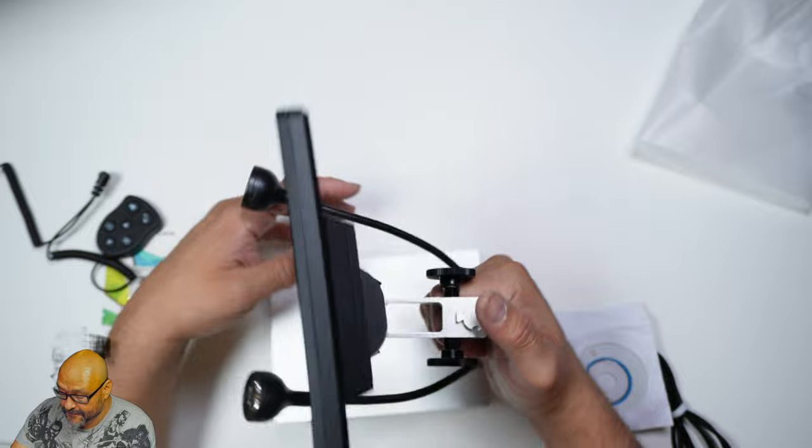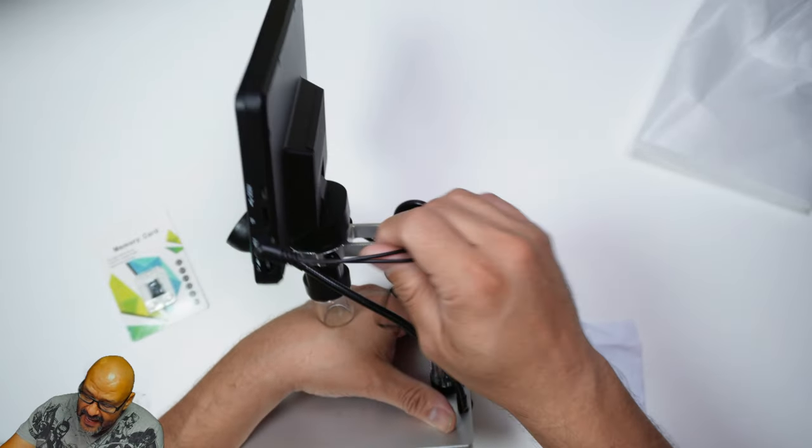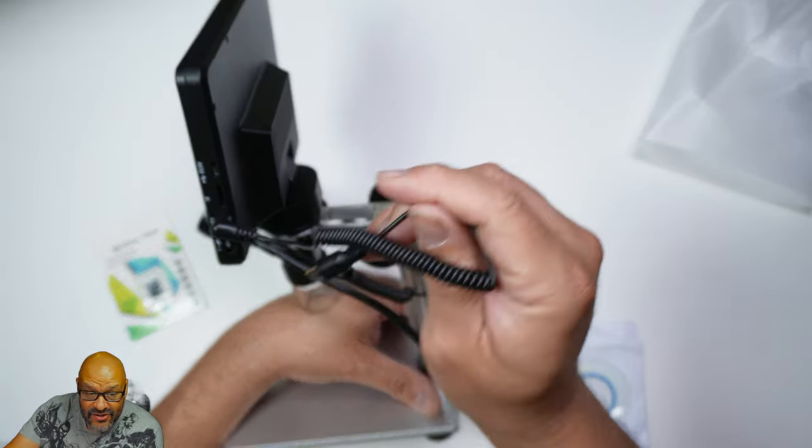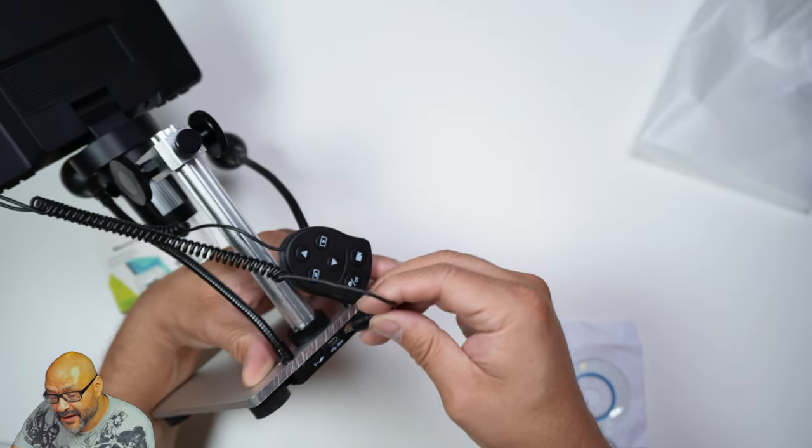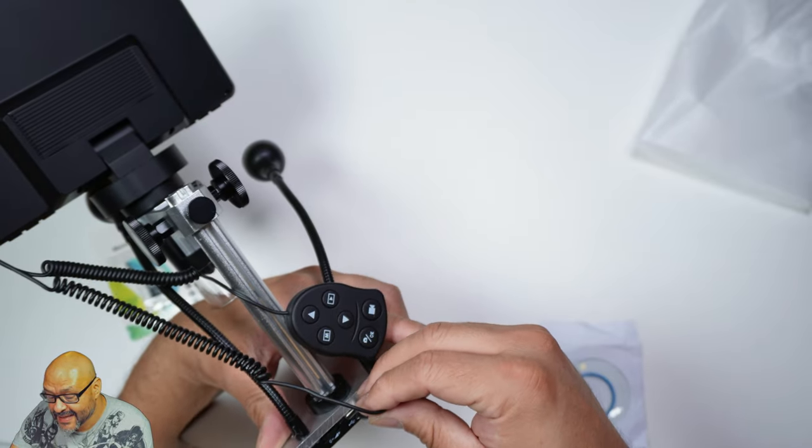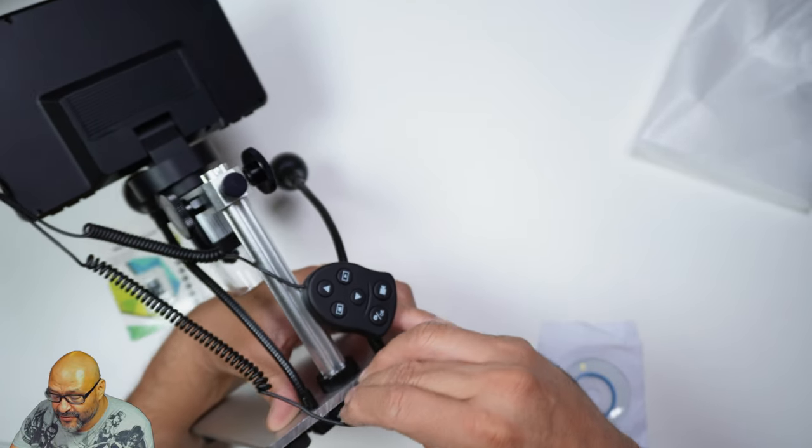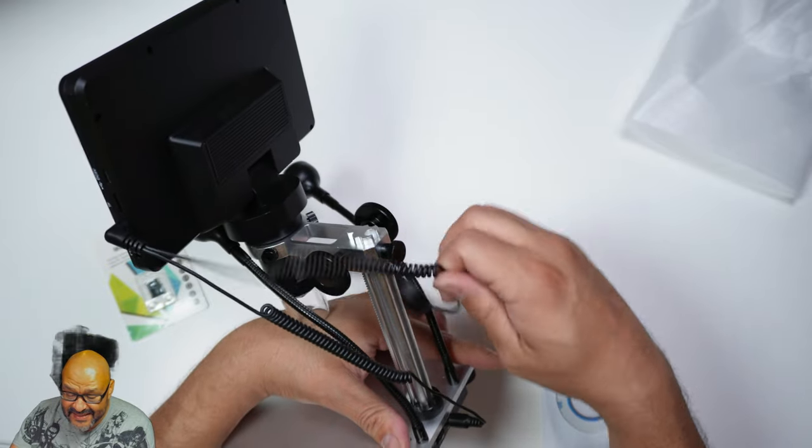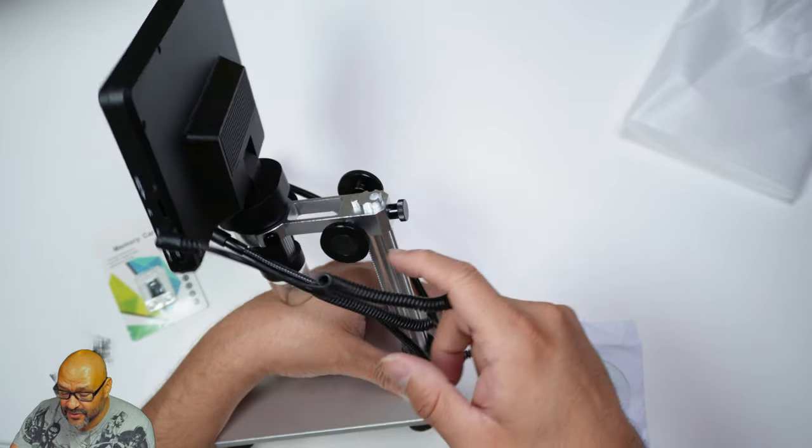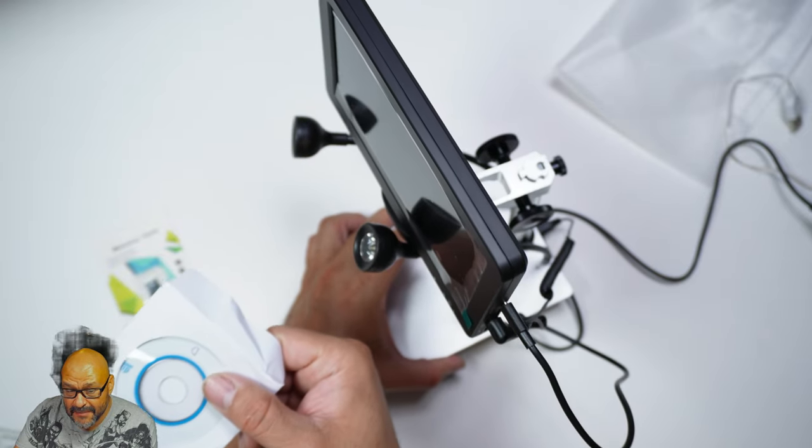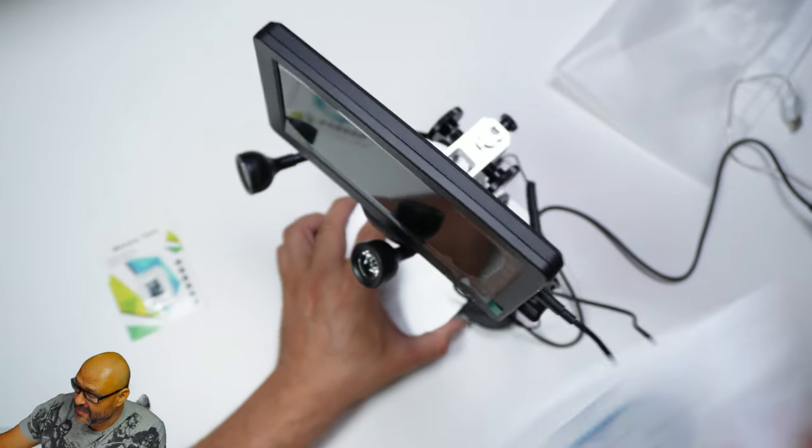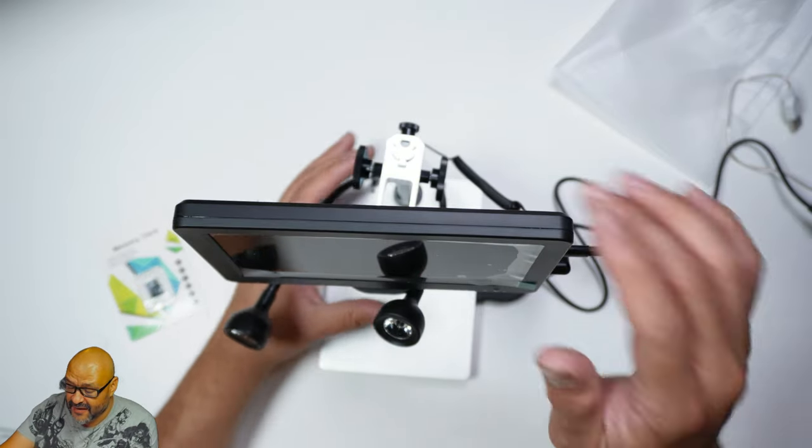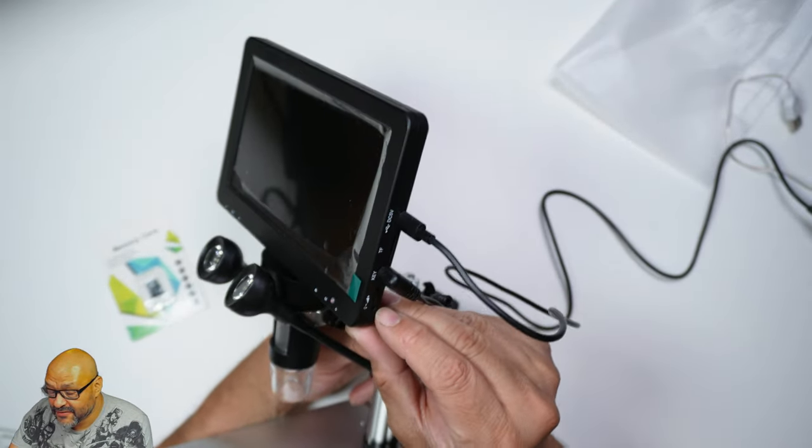One entry goes in the key entrance here and then this one cycles the power in the bottom. If you guys notice, there's a power connection here because it's going to give power to the LED lights. You don't have to do this if you don't want to use the lights, but it's something that splits the power. We're going to plug that in. They give you the CD too if you're going to install some application, but today we don't need the CD. We're going to set it up in our system. We're going to crank it up first time, turn it on.